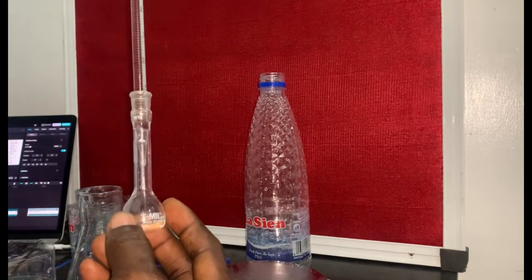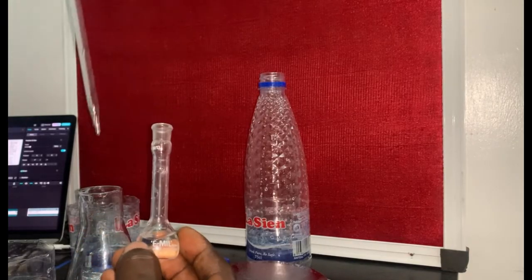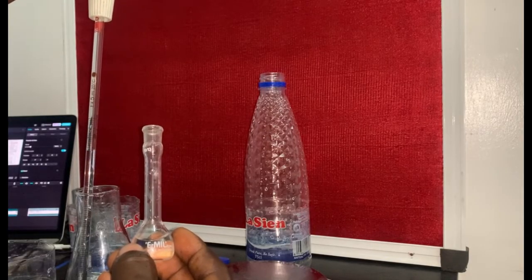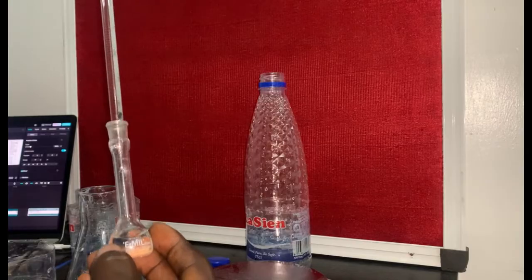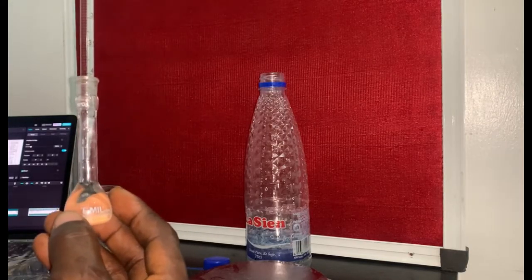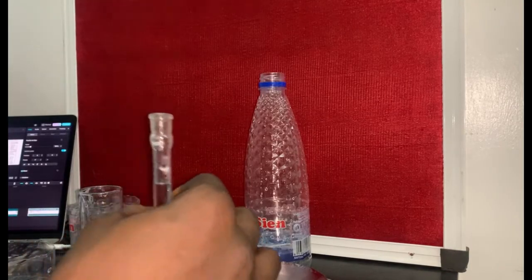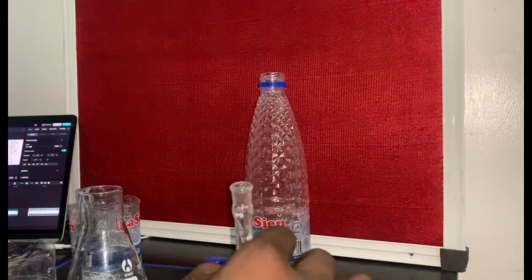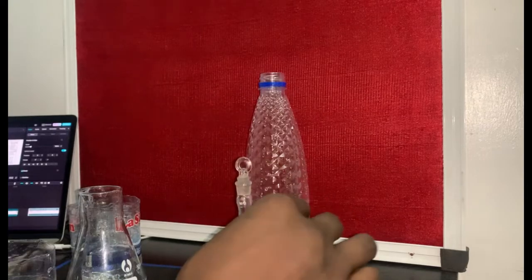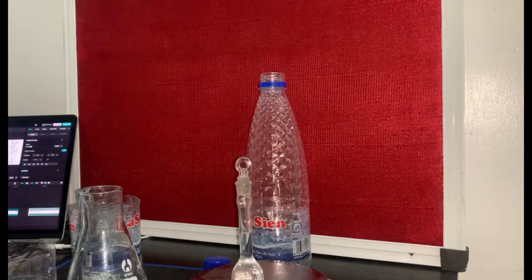Please, you can use your measuring cylinder in case. Alright, I come back here. I transfer it here. Okay, so I place this, but I must make sure I cover it. This is for the second mixture. I place it here. The mass of this mixture is 26.01.